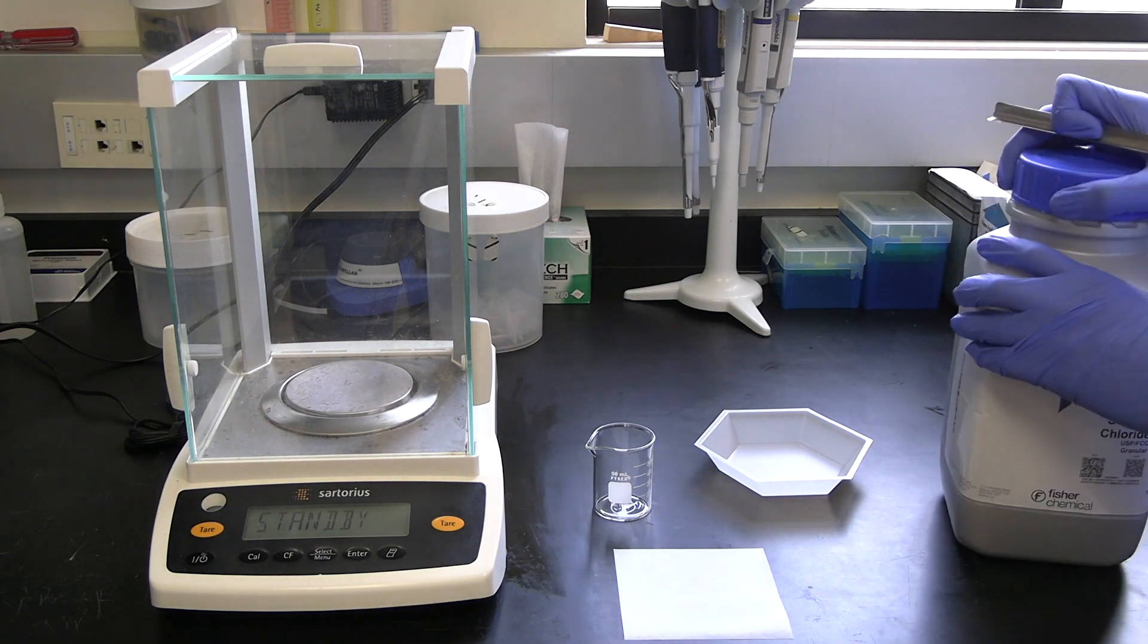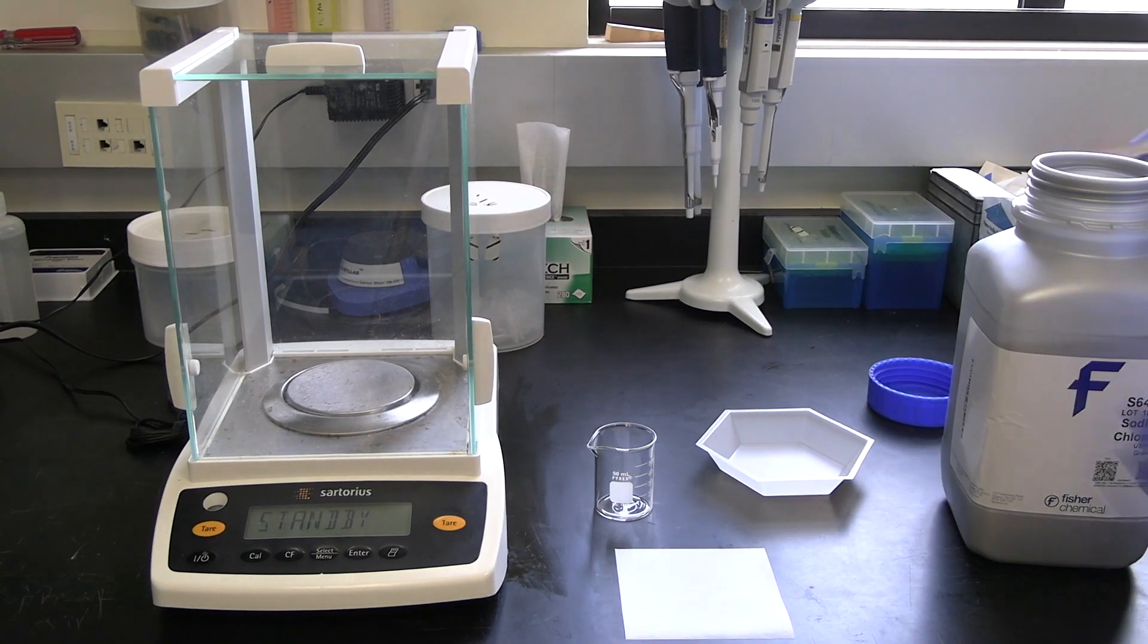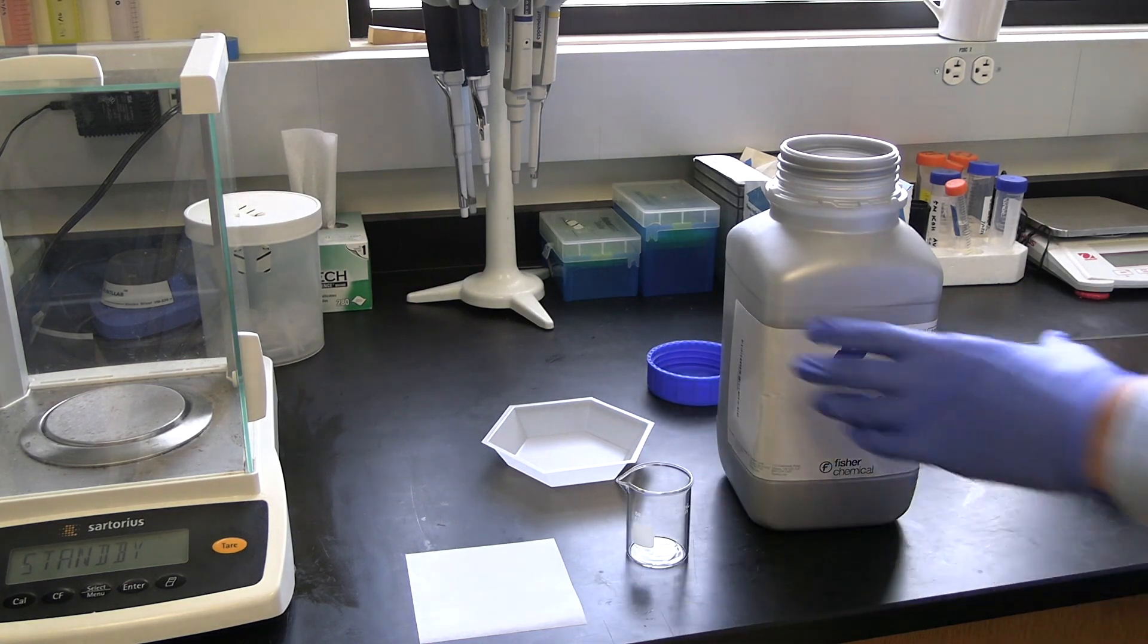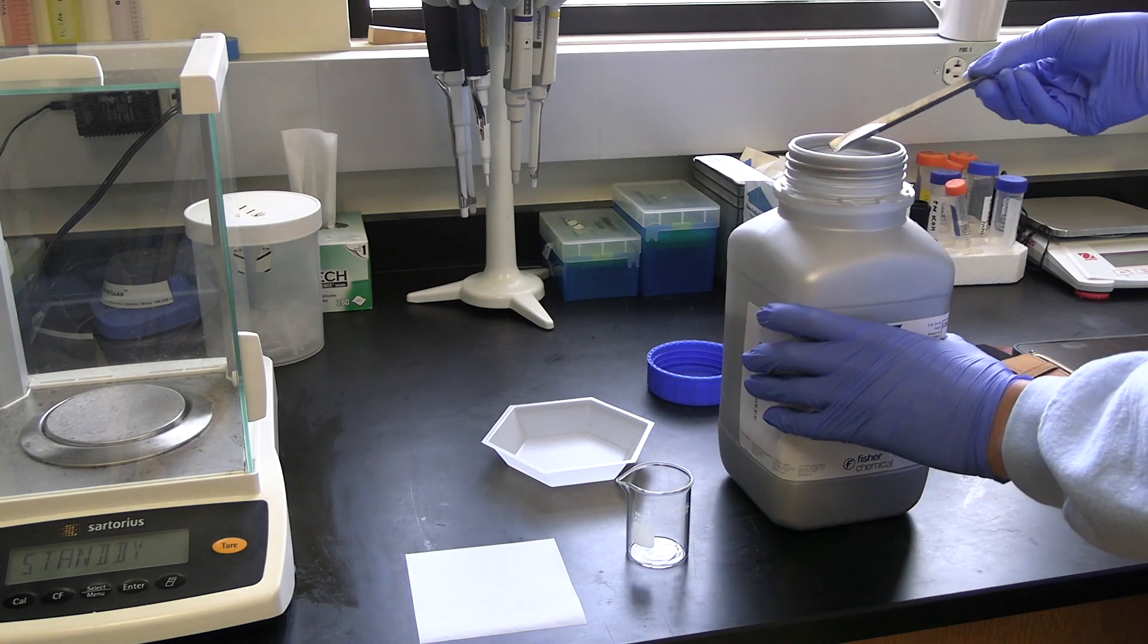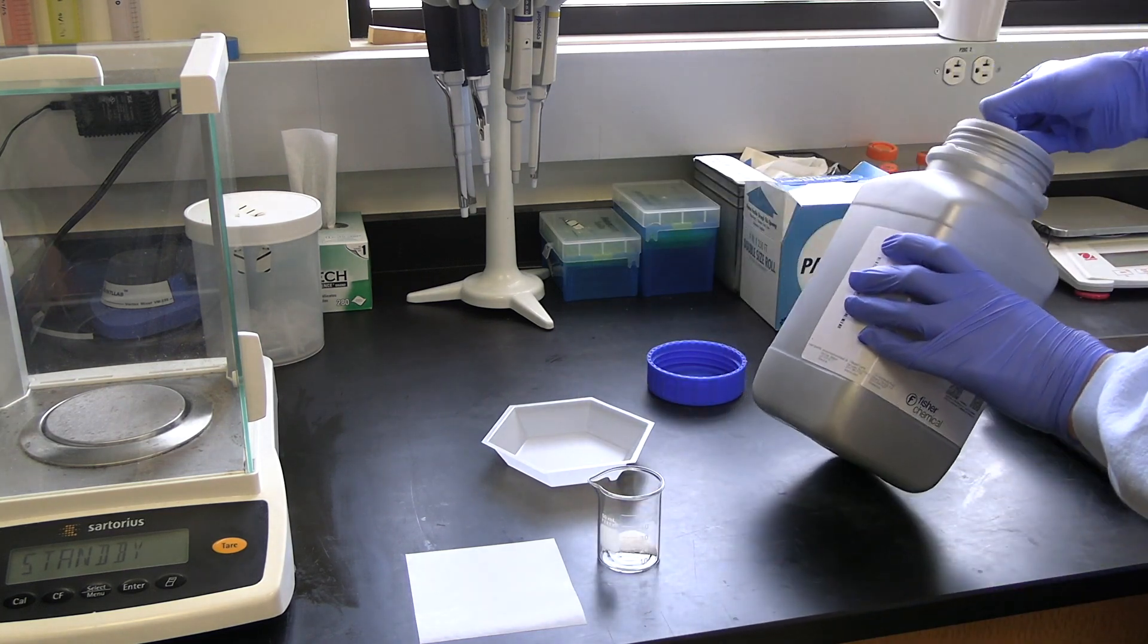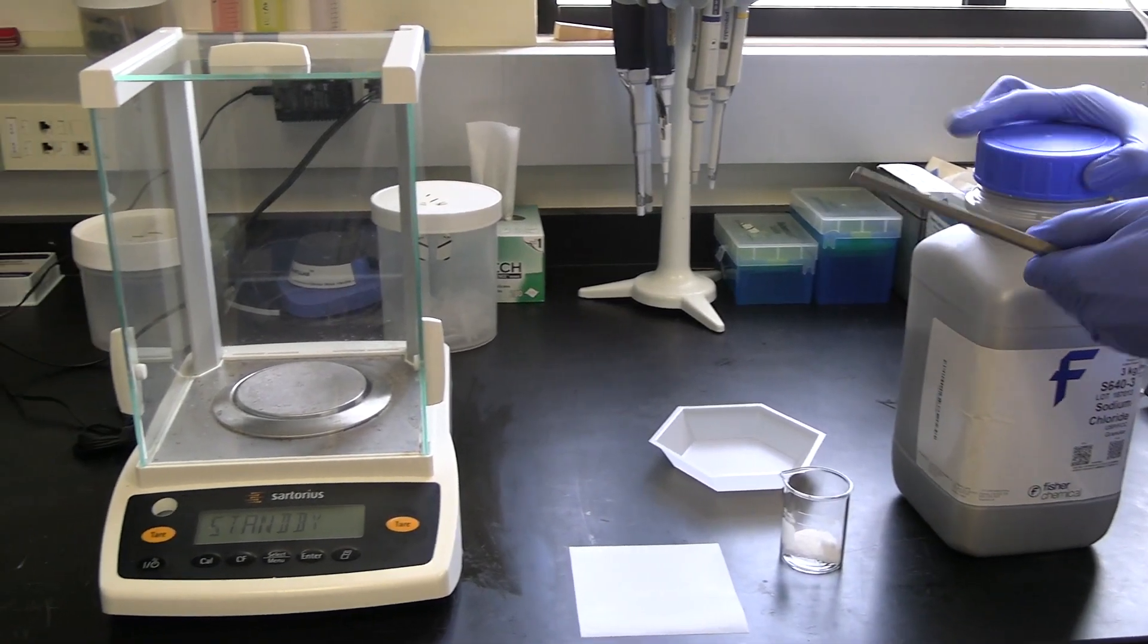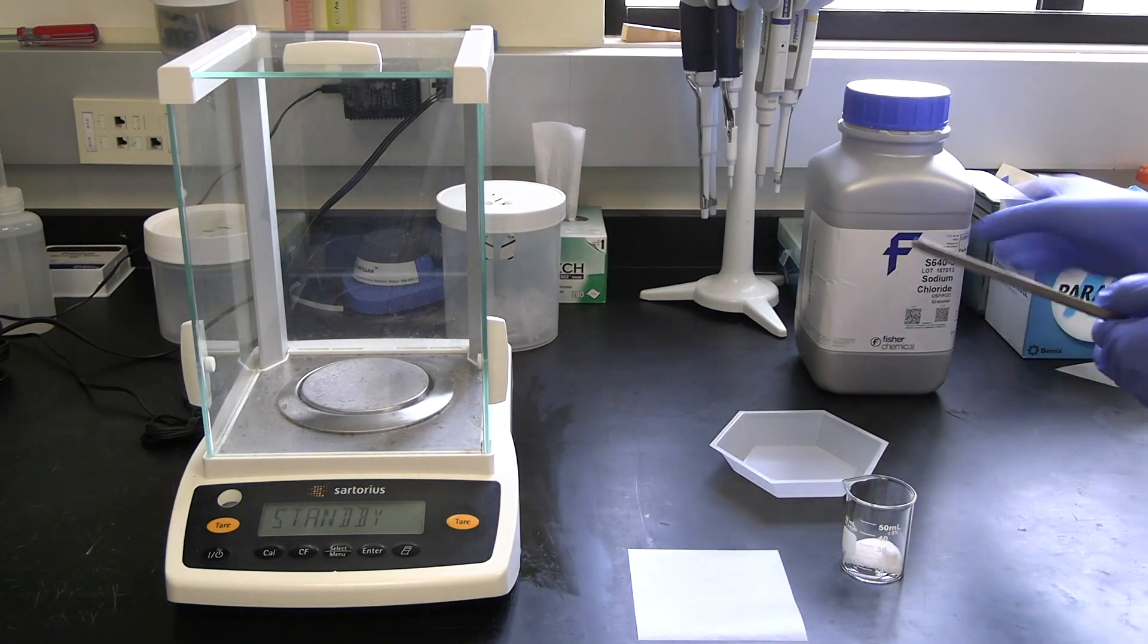Because this container is so large, we in general want to not double scoop from the stock container. So, we're going to use this spatula and put some of this sodium chloride into another container that we can repeatedly scoop from without risk of contaminating or making bad the original stock. So we're just pouring out an arbitrary amount of table salt. Once we're done with the stock container, we'll just cap it back up and put it aside and put it away later.